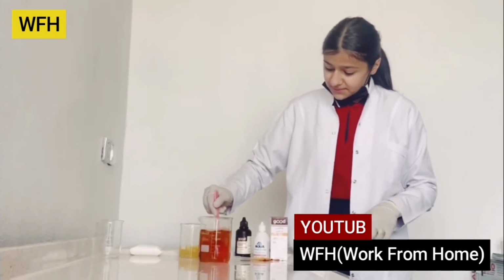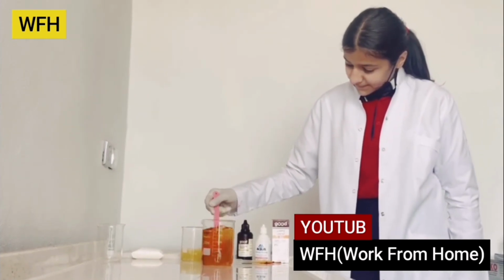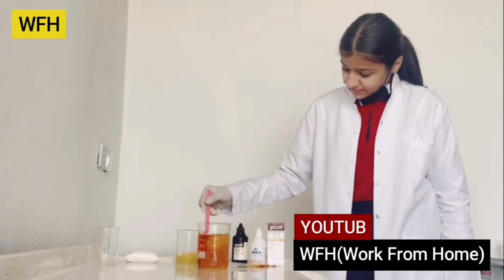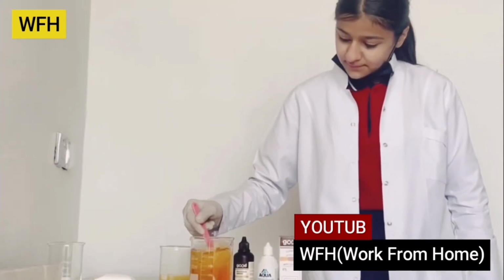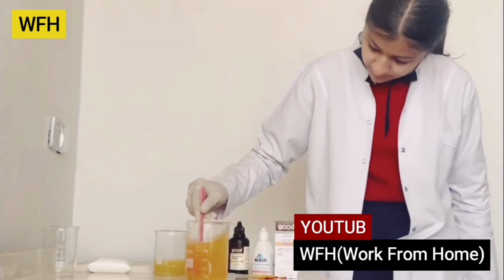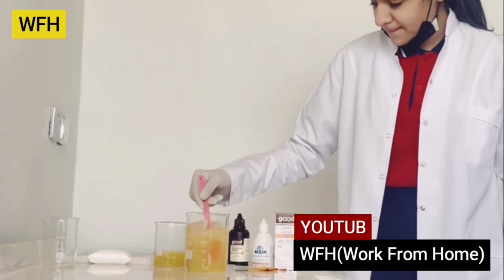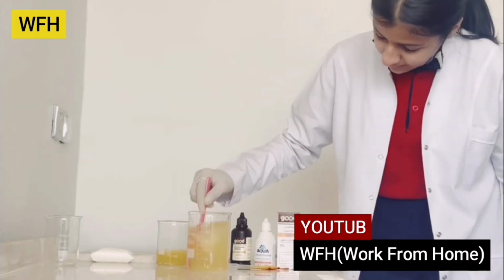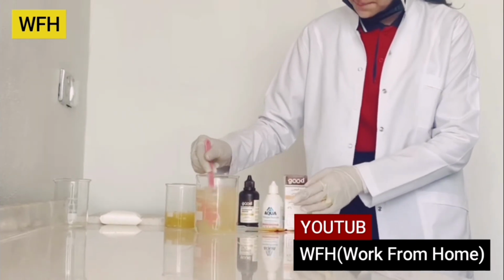So now I'll mix. As you can see, the color restores as the water color.